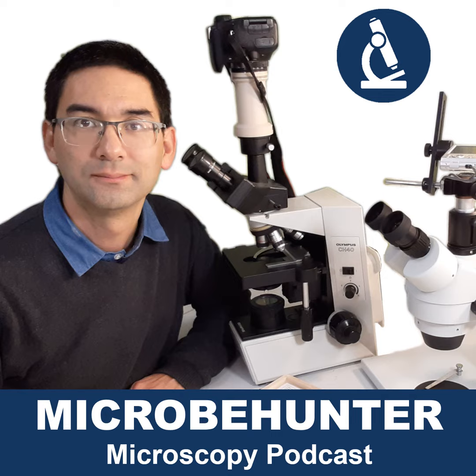The reason why the more advanced microscopes or the slightly better microscopes don't have them is for a variety of reasons. One of the reasons, and for me that's a main thing, is that the microscope optics and the microscope itself generally have a very long-term value. For example, on my desk I have a microscope from the 1980s, an Olympus CH microscope, and it works perfectly. I had it serviced a few months ago, so the guy came and cleaned the microscope and re-lubricated everything, and it's now as new, really.